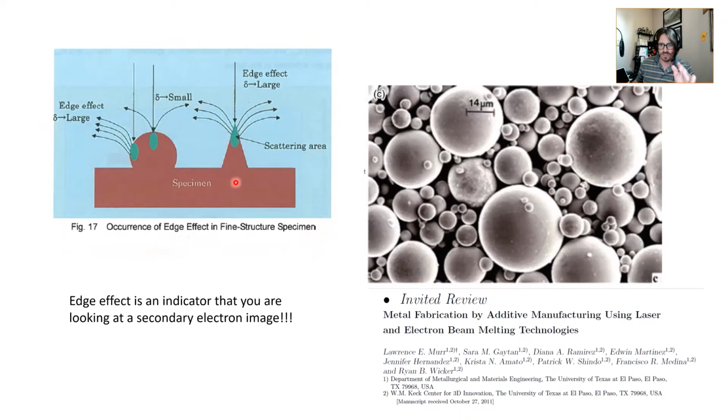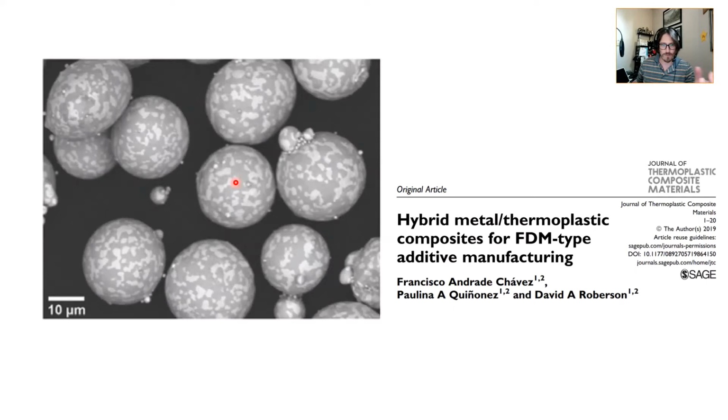In this case, we're using literally the difference between black and white to discern things. Okay, so think of it that way: difference in levels of black and white. This is the background. Incidentally, this is a carbon dot. This black background here, carbon dot. It is the darkest signal on this micrograph. For carbon, I don't even have to look at the periodic table. It's 6. Much lower than, I forgot, 50 for tin and 83 for bismuth. Okay, so that explains your contrast mechanism on this backscattered electron image.